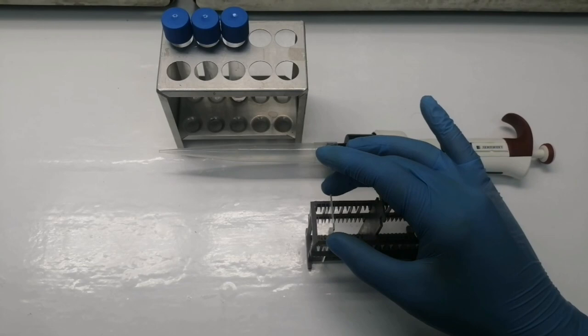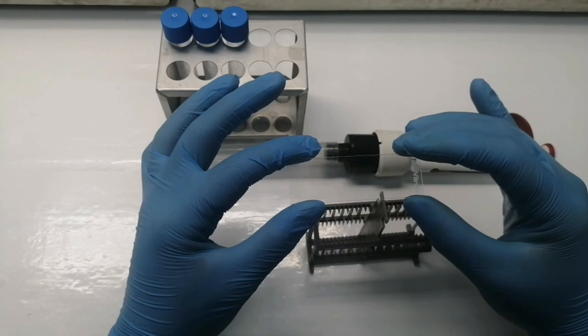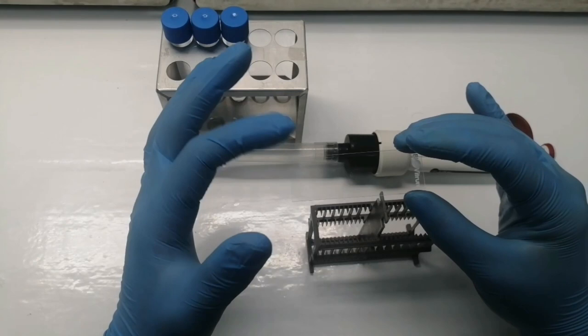As for the glass slides which have the epithelial cells and the inflamed cells from the gingiva — if we put them now in the microscope, we can't see anything because it's without staining, without the coloring of the tissues.